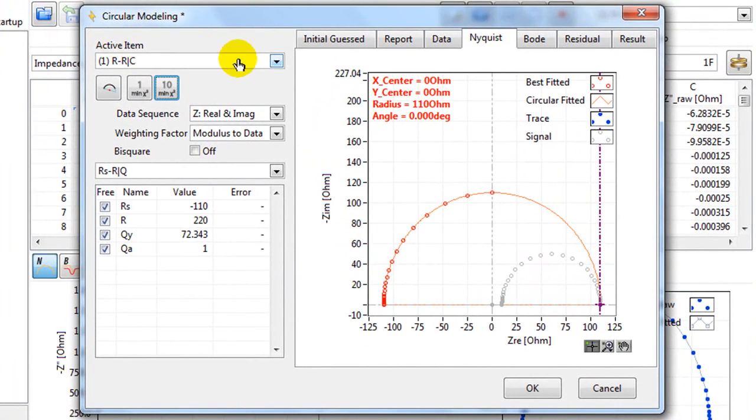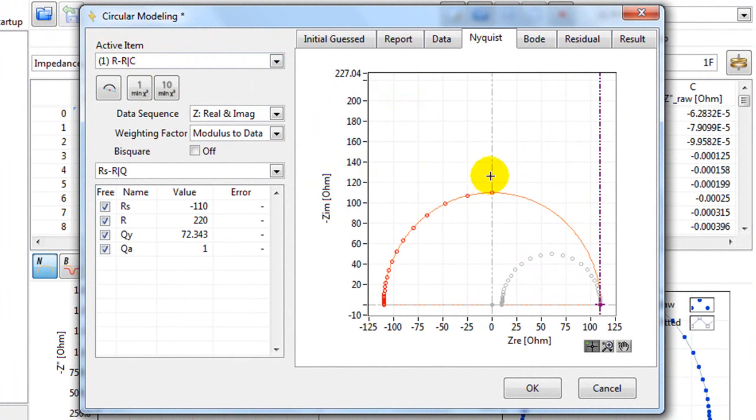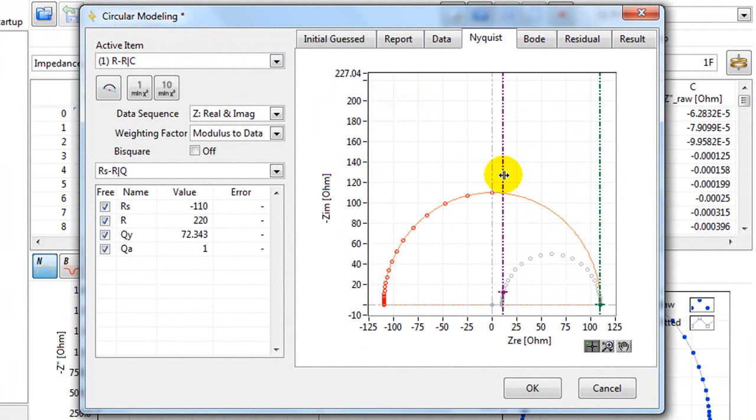You should choose which run to analyze. Let's start with the first one. On here you then move the violet line and the olive line to form the semicircle.